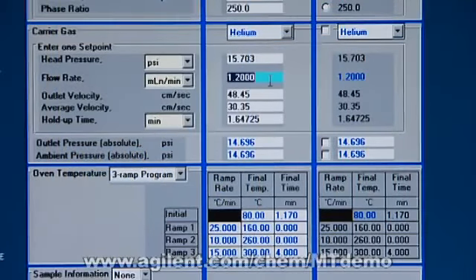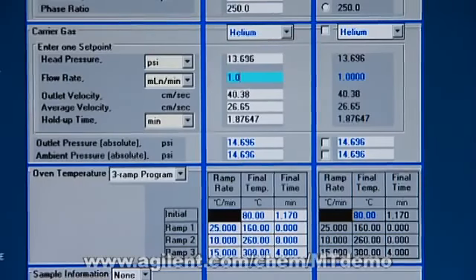Now, we're going to run at 1.0 mils per minute, and that's a typical flow rate for a column of this size. It tells me that I have 13.696 will be my head pressure.